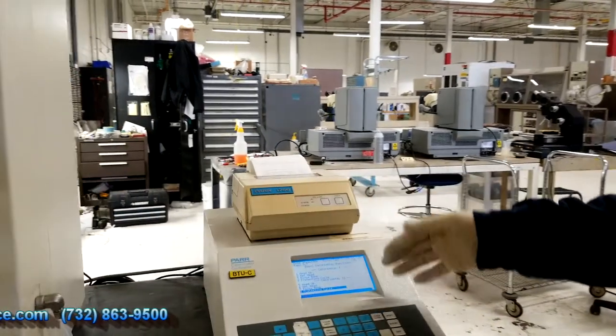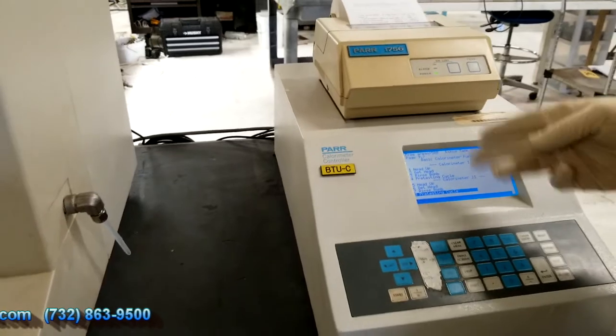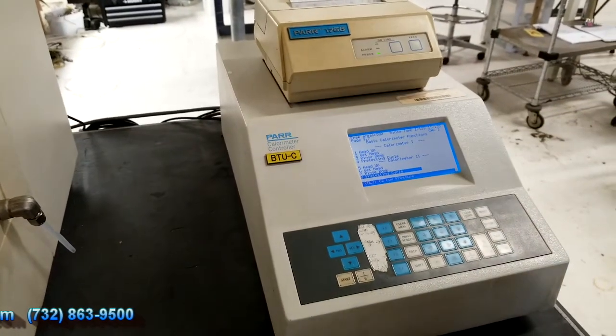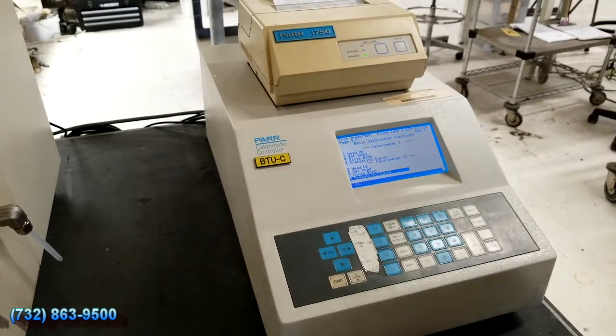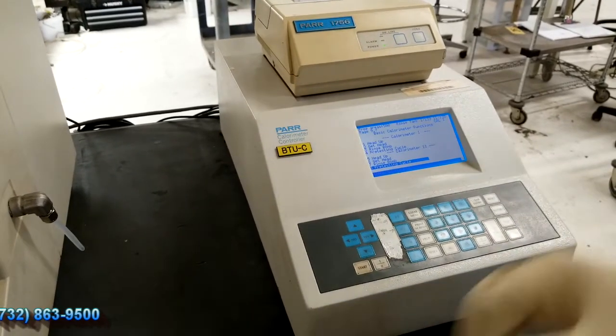Okay, so going back to this screen here, again, these are basic calorimeter functions. Head up and get head is demonstrated by the pre-testing cycle by placing the head into the vessel and removing it when necessary. The only thing we didn't see was the rinse bomb, so we'll go ahead with number 3 since I have the beaker under there on this port here, on number 1.